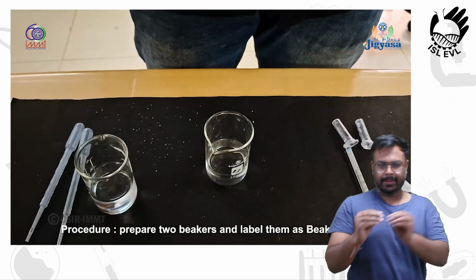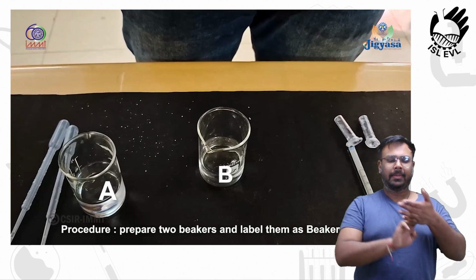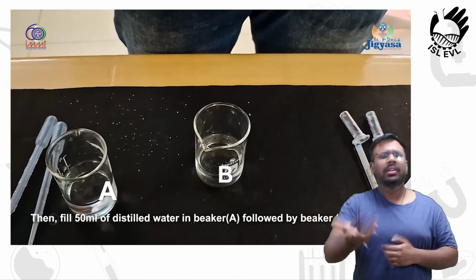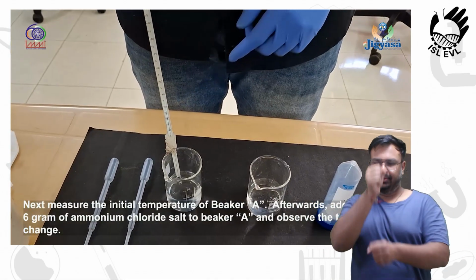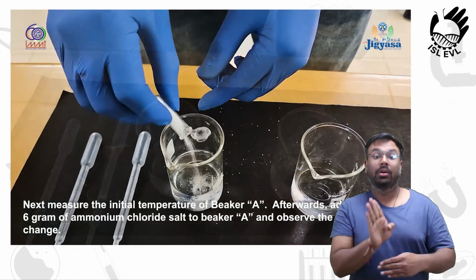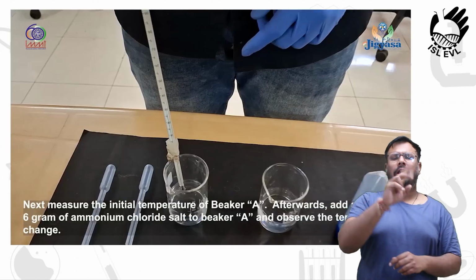Procedure: prepare 2 beakers and label them as beaker A and beaker B. Then fill 50 ml of distilled water in beaker A followed by beaker B. Next, measure the initial temperature of beaker A. Afterwards, add about 5 to 6 gram of ammonium chloride salt to beaker A and observe the temperature change.